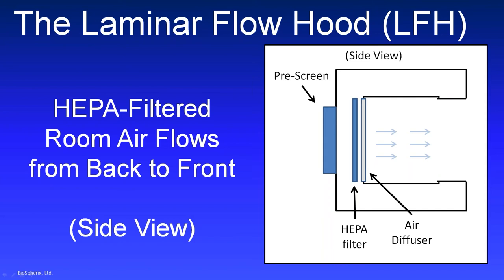This space is not designed for open processing, unlike a room air BSC, although it looks kind of like a BSC. It's really designed to be a safe space to disinfect items and leave them to dry before they come into the system, and to protect the doors of the system from room air, so that only HEPA filtered air goes past those doors.